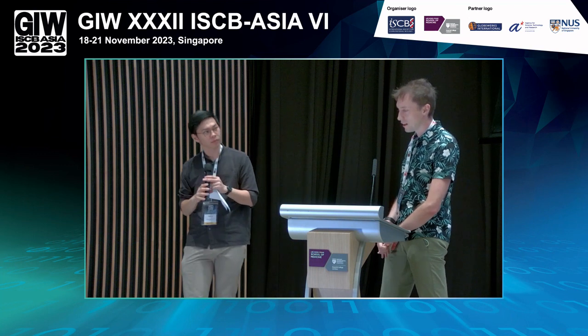Okay, yeah, and I think that's actually quite crucial, because if I understand correctly, some of the outbreaks of diseases and things are quite time sensitive. Yes. So actually, at the end of the day, every hour that you save, you're saving quite a lot of money as well. Yeah, of course, part of this question is how willing is the company to test every day versus once a week, because you would probably have to do that if you wanted to capture something early. Otherwise, you're relying. So I should have said as well that the company also does chemical and physical environmental testing. Oh, okay.